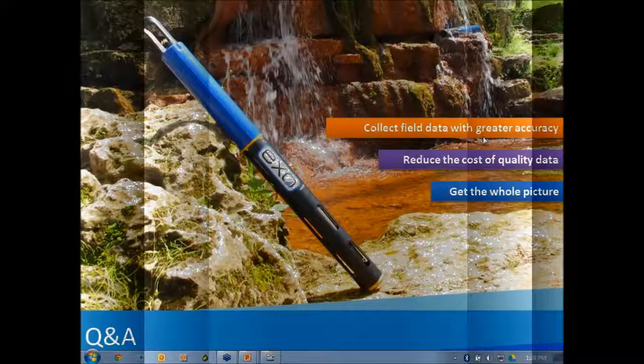Tim or Brandon, are you ready to answer some questions? Sure. I have a couple questions I can answer real quick. We got a couple questions here about probe maintenance. This one asks, do the total algae probes require much maintenance? No, there's really very little maintenance involved with the probe because of its optical design. You just need to keep the optics clean to get good readings. Before you take it into the field, inspect the lenses occasionally, and if there's anything you need to clean off, use a really non-abrasive cloth, probably something lint-free, if cleaning is necessary.